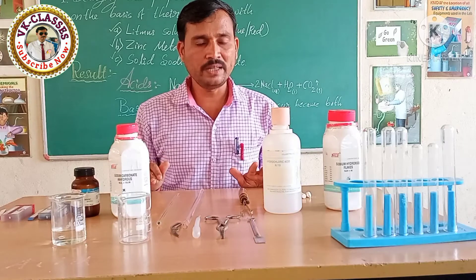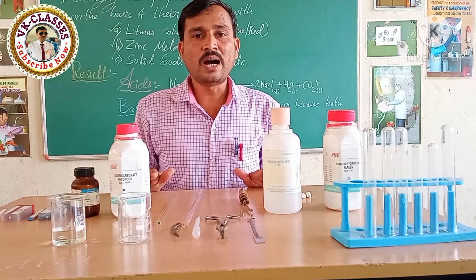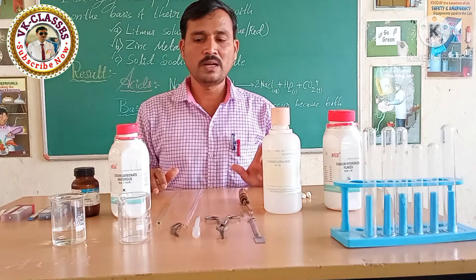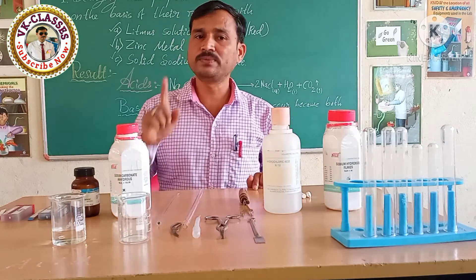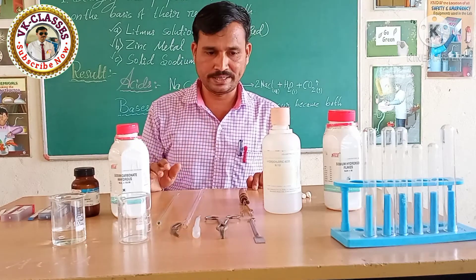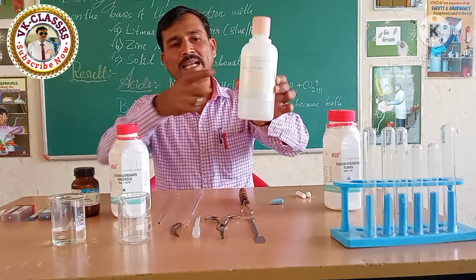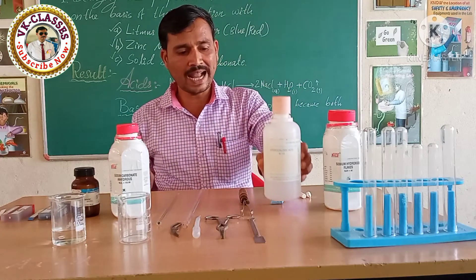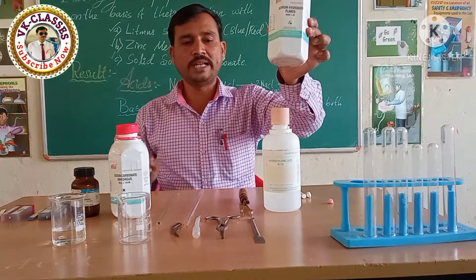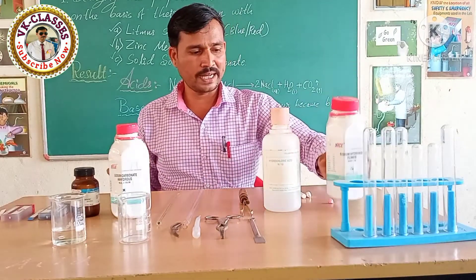Here is the equipment which I arranged on this table. I will give you a brief introduction about this experiment. As per the title of the practical — studying the properties of acid and base — I took a bottle of dilute hydrochloric acid and the base which we need is sodium hydroxide.